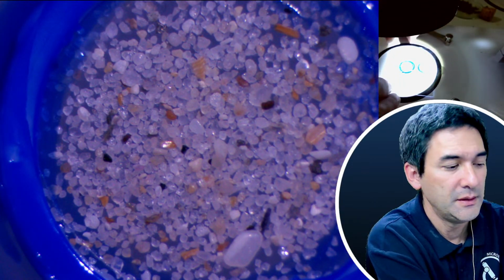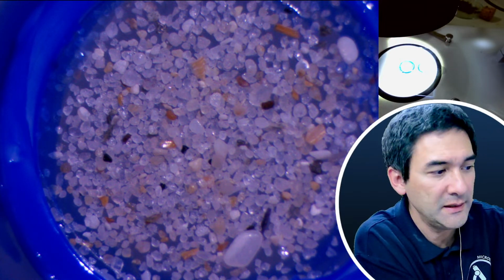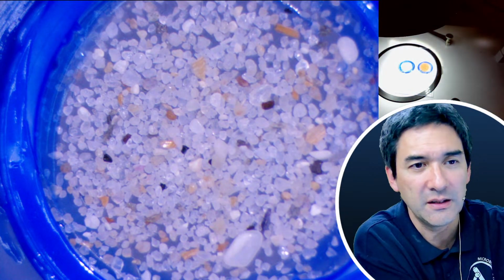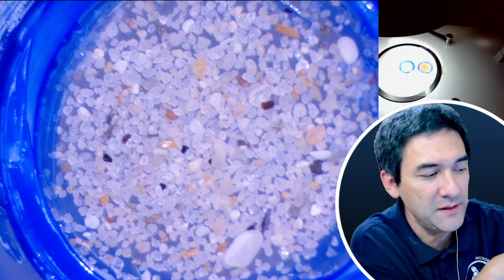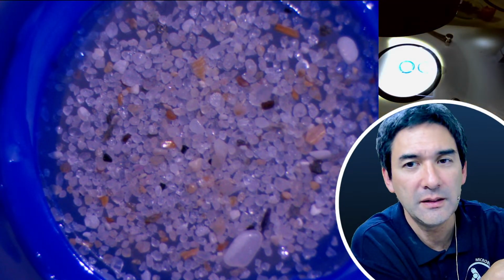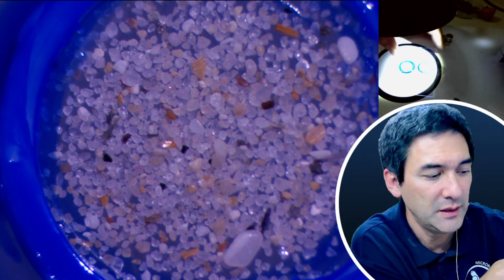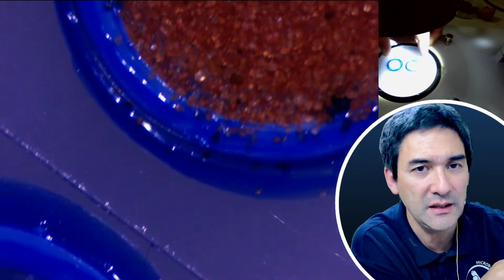So that is essentially light coming from the side, and now this is light coming from the top. It does look more flat if it's evenly illuminated. It's a little bit dark because the LED is not quite as strong. But yes, there is a difference.